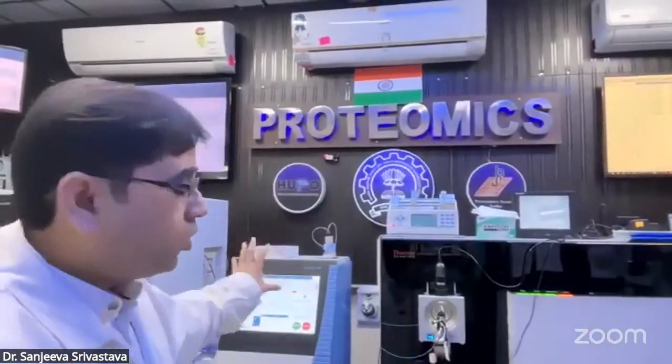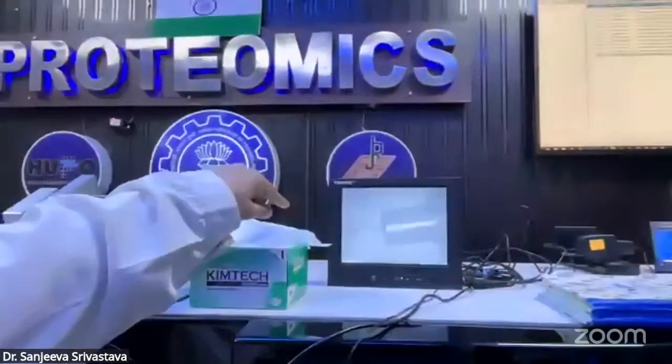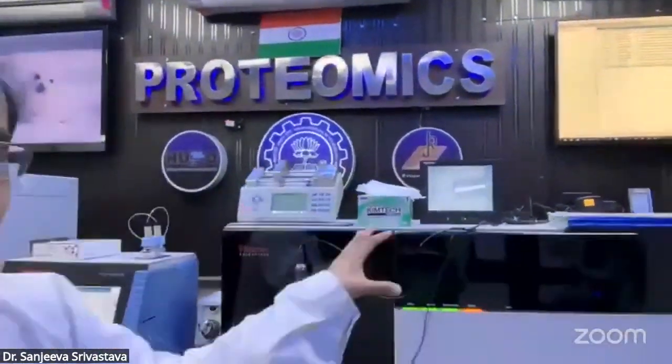If your goal is to quantify two different conditions and look at differential responses, again, you can use this technology. Any mass spec usually has a chromatography component. In this case, we have the nano-LC component, and then we have the front end. The first part is the electrospray ionization, how you ionize your peptides. You can see the insert, where the ions move inside the mass analyzer. This instrument has three different types of mass analyzer, known as the tribrid technology, having the quadrupole, Orbitrap, and ion trap. So this instrument we mainly use for deep proteome and quantitative proteome analysis.